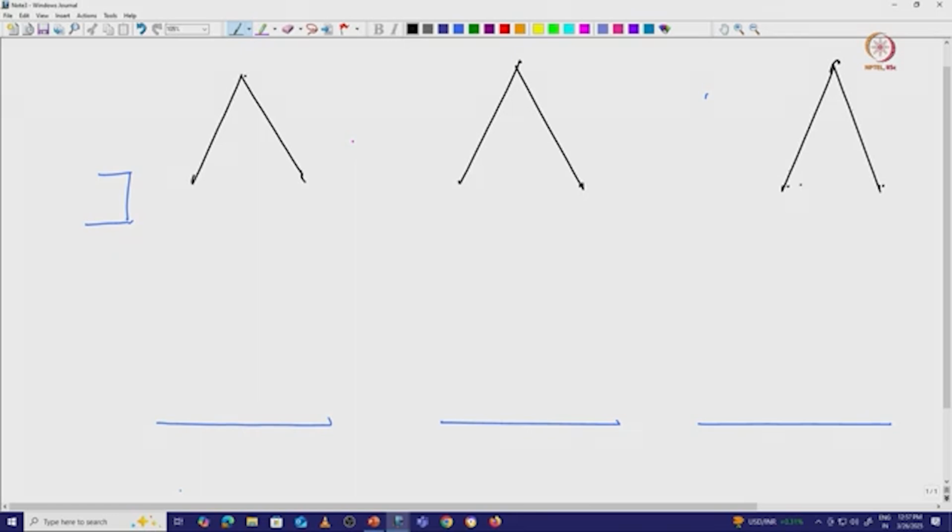Okay. So now, as we mentioned, we have an electromagnetic lens, which is going to regulate the magnetic field. We just consider this is lens 1, this is lens 2 and this is lens 3.